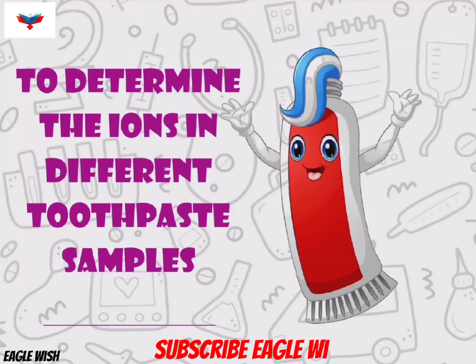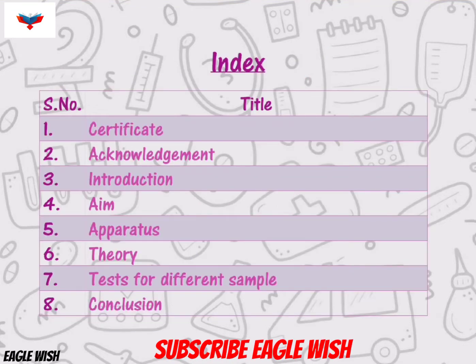In this video, I'm going to show you a chemistry investigatory project on determining the ions in different toothpaste samples. We are only going to analyze two toothpastes. First is Colgate and second is Close-up. So let's start our project with the table of contents index.